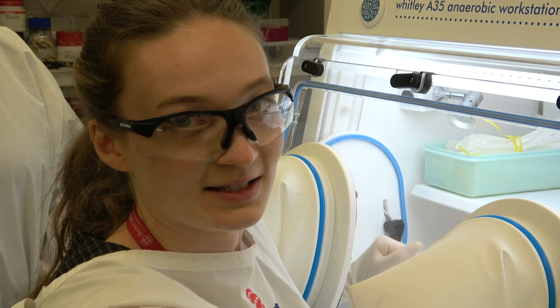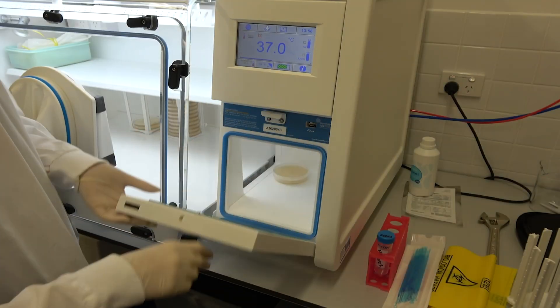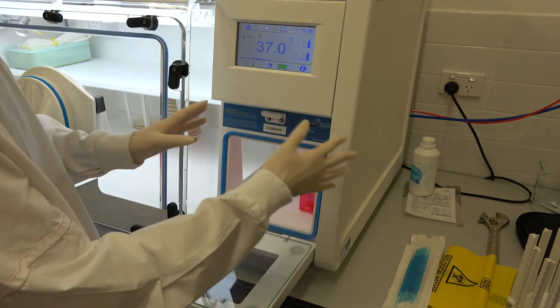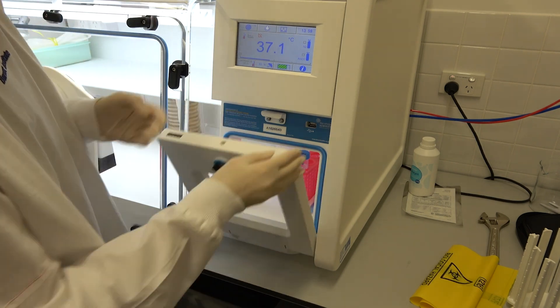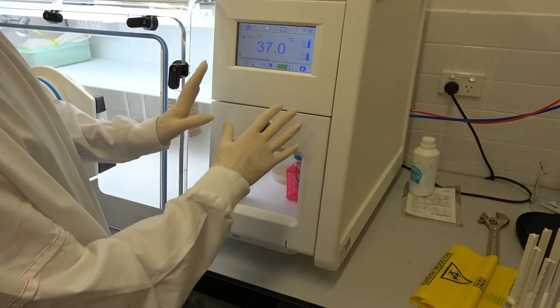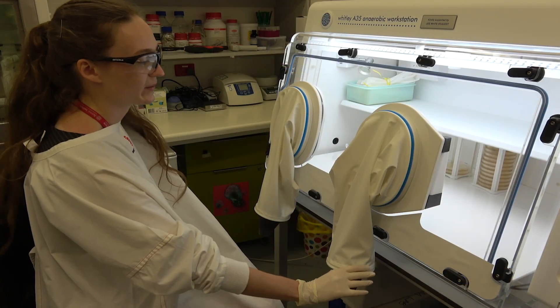Here's a little insight into how we operate this workstation. This is how we take materials into the anaerobic chamber — this is the airlock. It's like a separate little sealed box. We can close this up and then remove the oxygen from this box so that we can take the items into the main chamber.